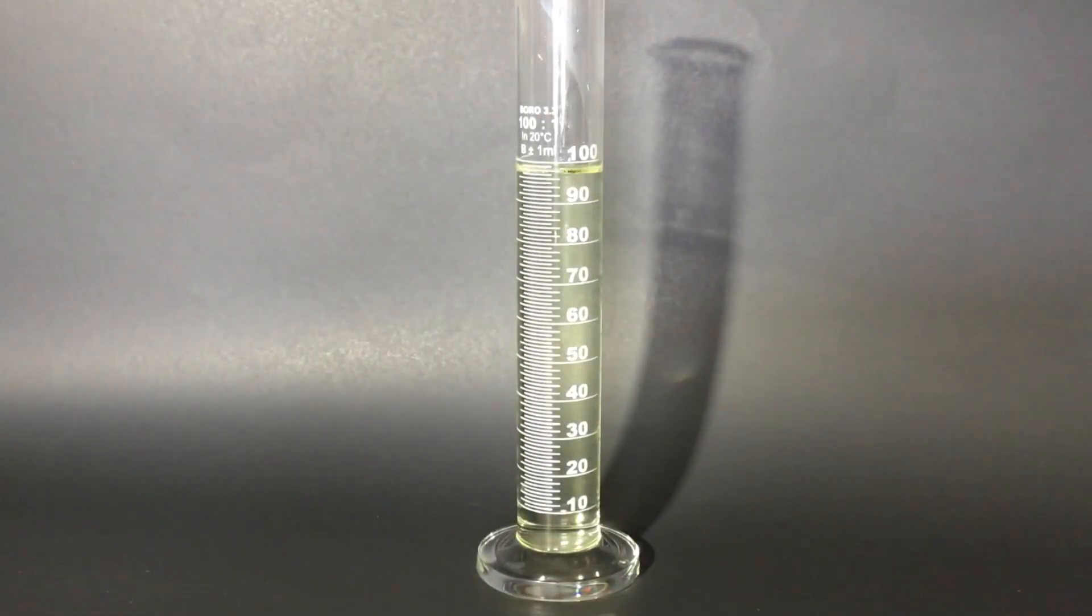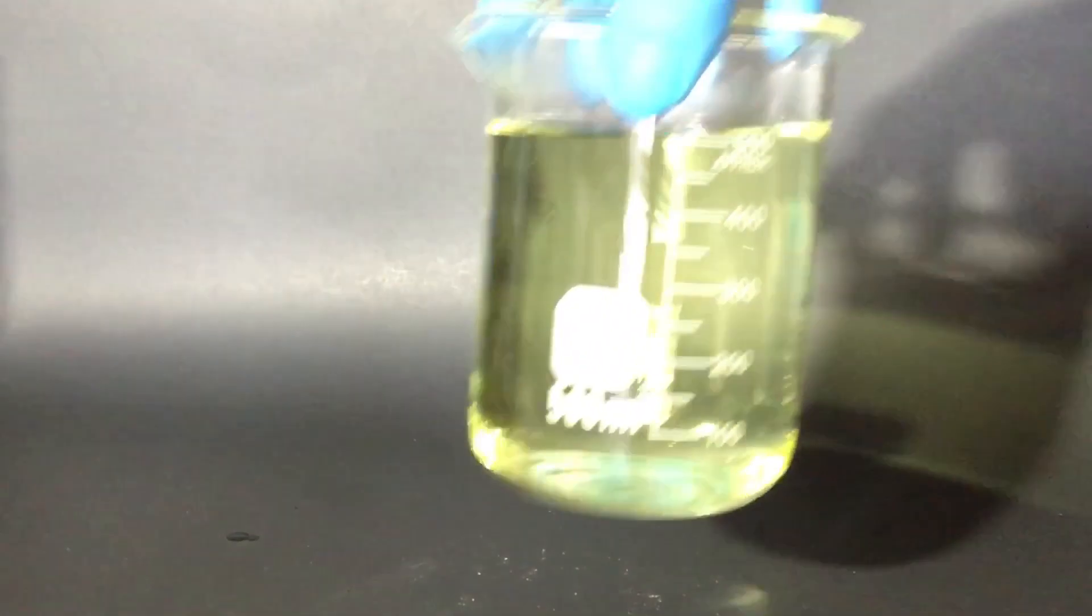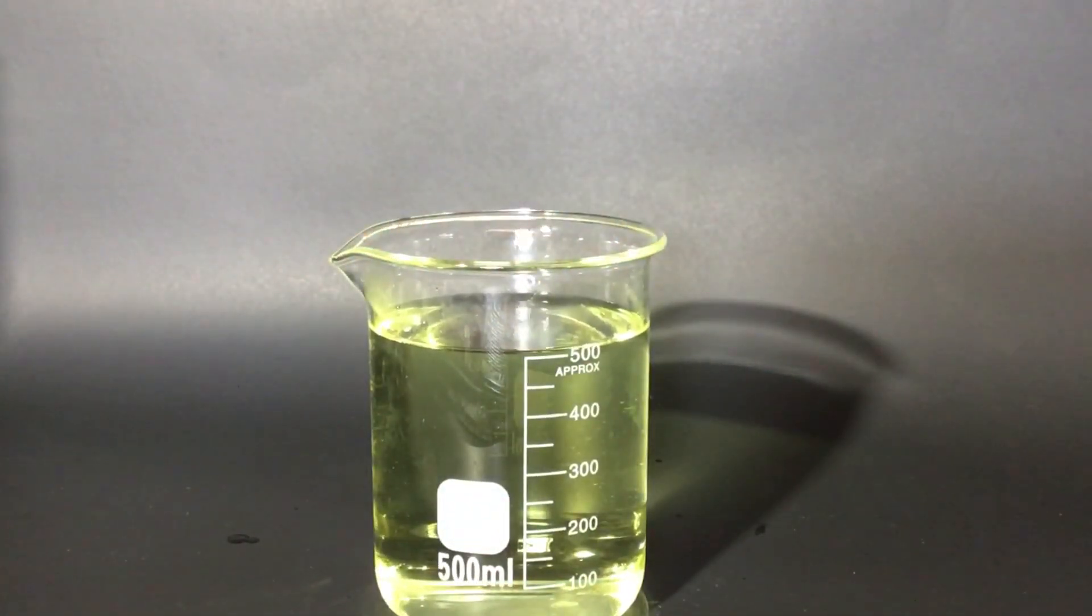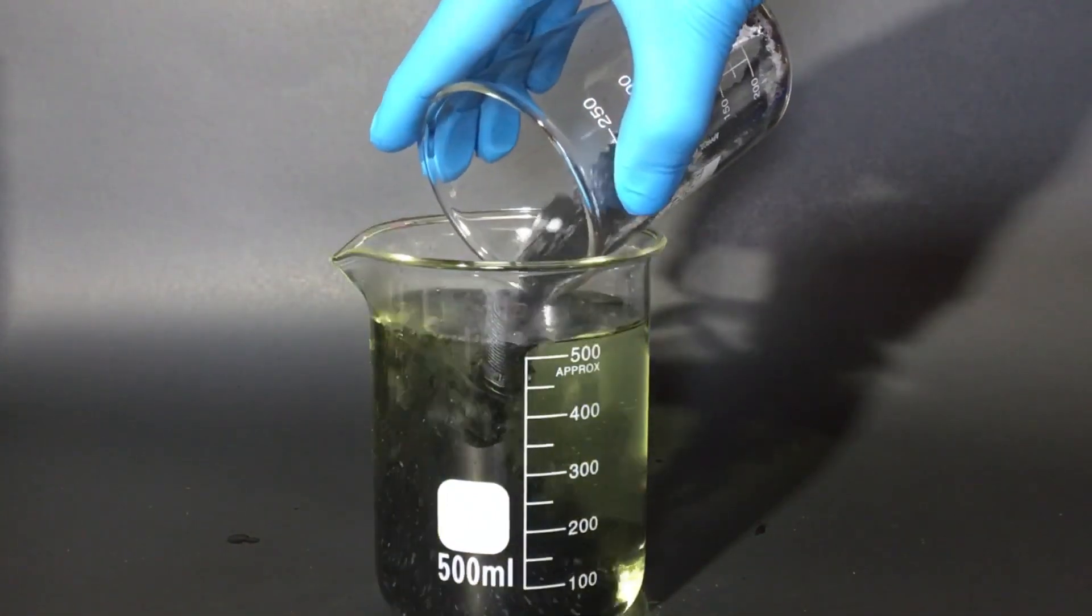I could have just added it all into the beaker at once and still gotten an almost exact amount of bleach I needed, but I still just wanted to use my graduated cylinders. Now what I do is I add all of the solid stuff into the bleach, and this is when I realized I messed up.